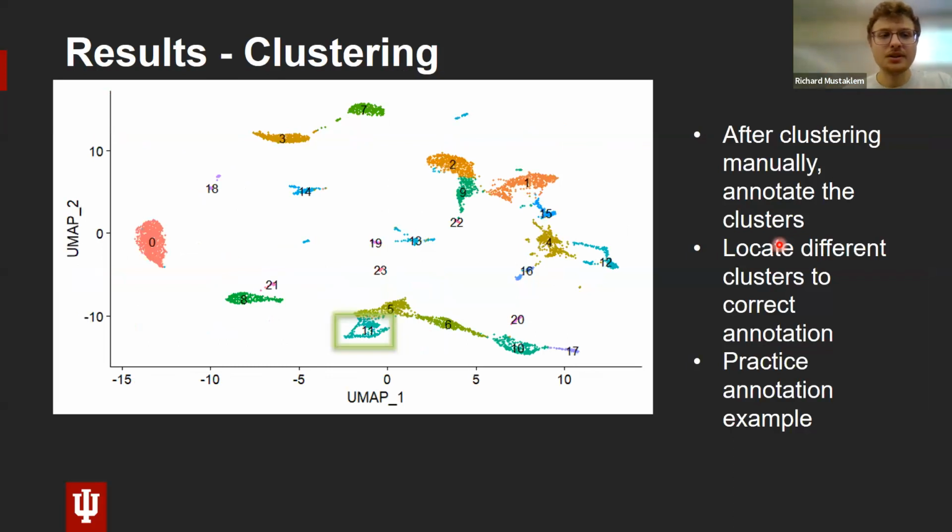So next up, we're going to mark our UMAP, and I'm pretty sure I included it in my code on how to run this. If anyone's running the code, can you make sure that I included this in there? Otherwise, I can give you the code right now. I thought I updated it last night, so does it have the numbers on it or no? No, okay. Oh, I see. So it's just one column. So I don't have to worry about this.